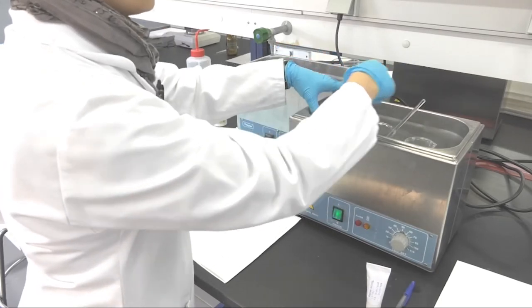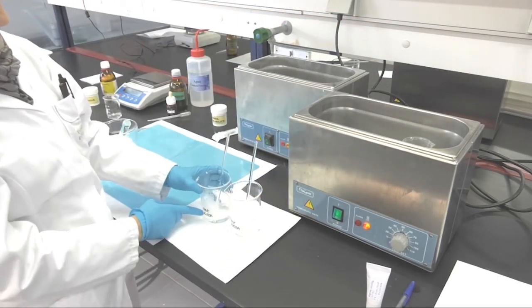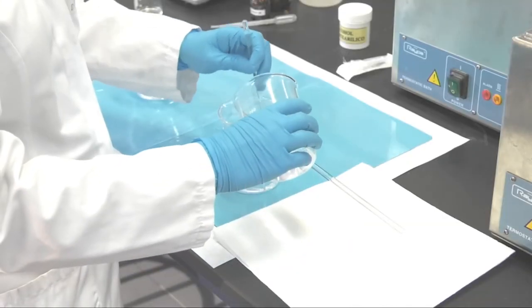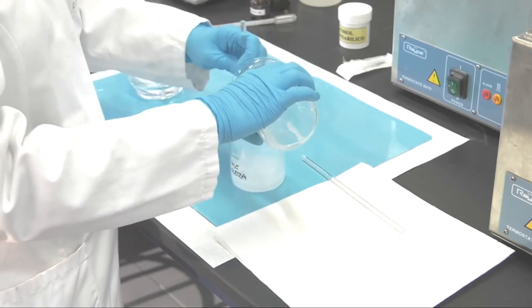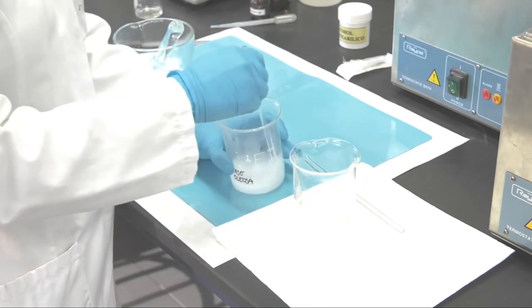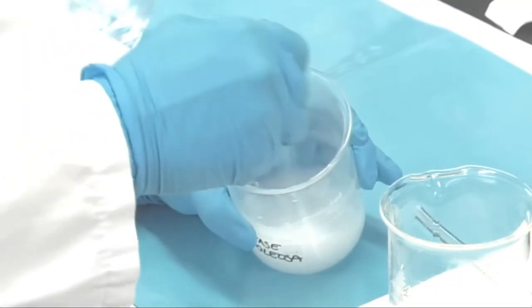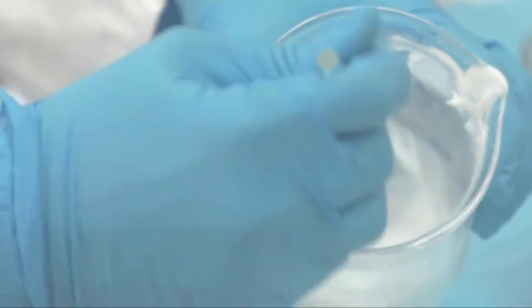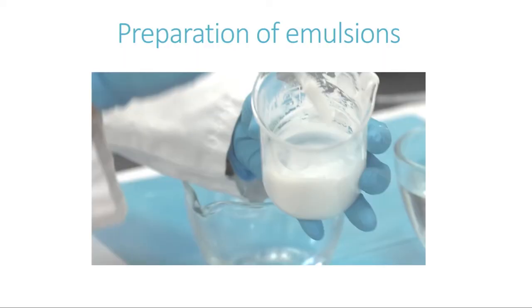Another tip we follow at the bench is to always add the water phase onto the oily phase. In industry this can be done the other way around according to the nature of the final formulation, but here we prefer to always use this system to avoid solidification of the oily phase during manipulation and temperature differences within the beaker. Once the water phase is added to the oily phase, we should stir continuously until the final formulation is formed at room temperature. As you can see, as the formulation cools down, the viscosity increases.